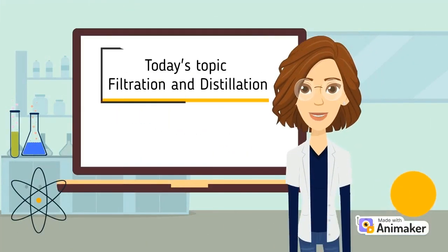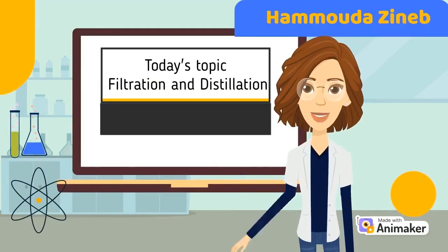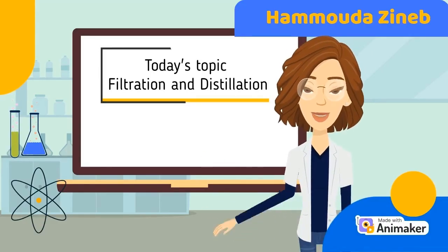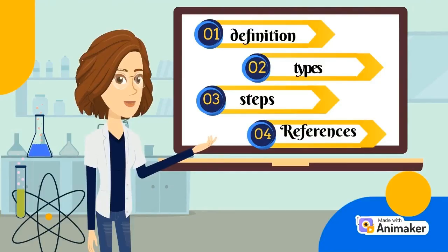Today we will learn about the techniques of filtration and distillation and explore the different laboratory equipment and glassware used. In each experiment, we'll define it, its types and steps involved, and then show you the references we relied on.